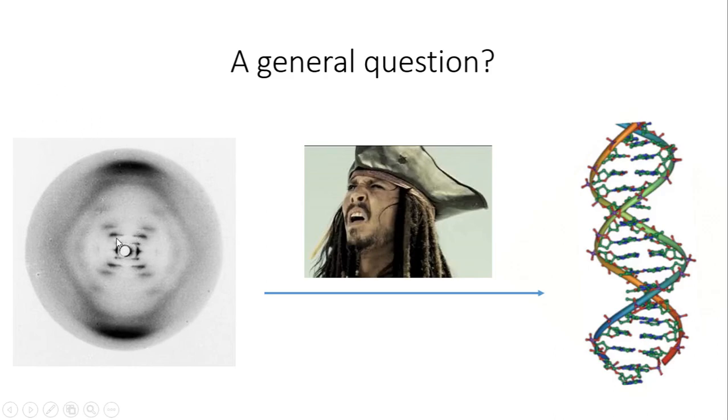So overall, my idea of creating this video is to make you aware of how things start and what you usually end up observing, or what you end up downloading from the PDB, and you might start to visualize or analyze the macromolecular structures.